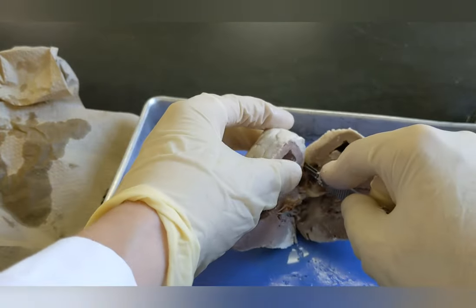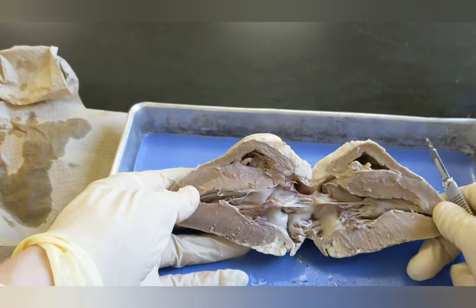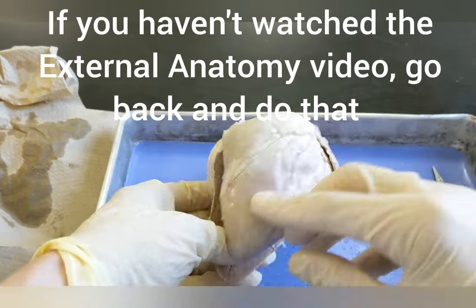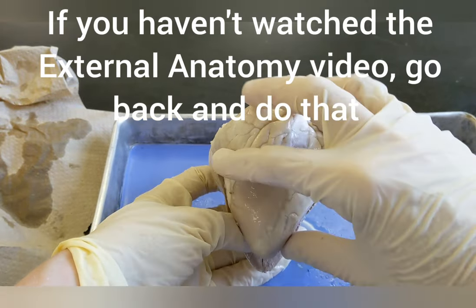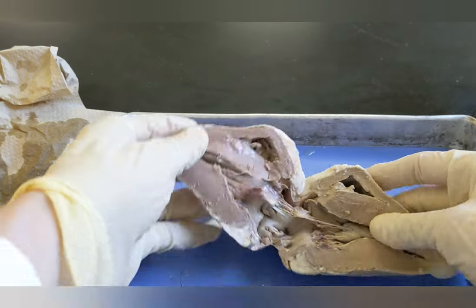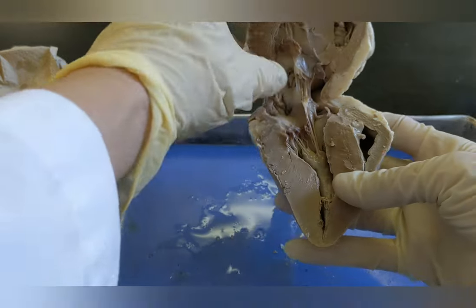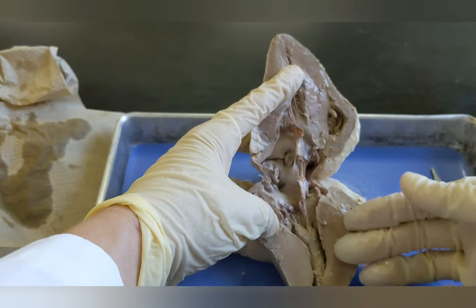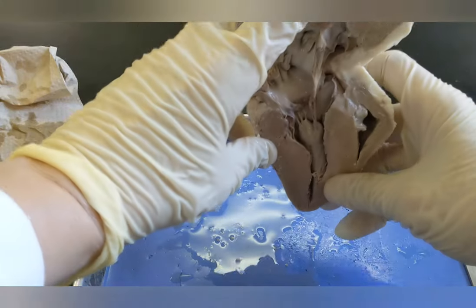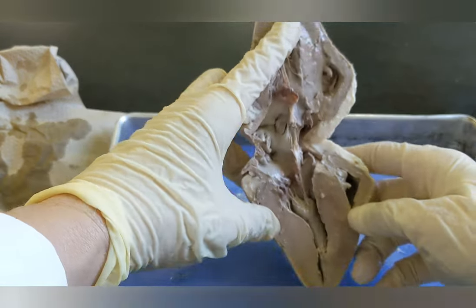When we open up the heart, the first question we want to ask ourselves is: what is the front and what is the back of the heart? You can close it to remind yourself — that's the front, so this is the front piece. That's the back, so this is the back piece. You should also be able to tell this is the front because once it's opened, the left is going to be on the left side. So if this were my heart, my left is on the left when it's facing forward and my right is on my right.